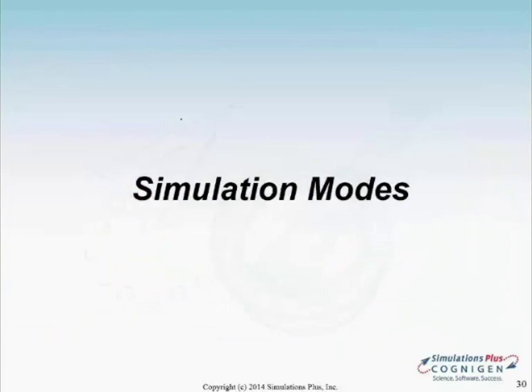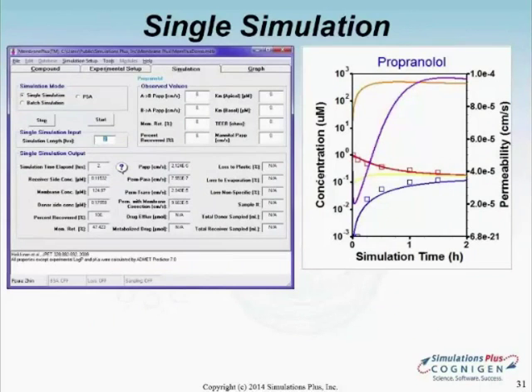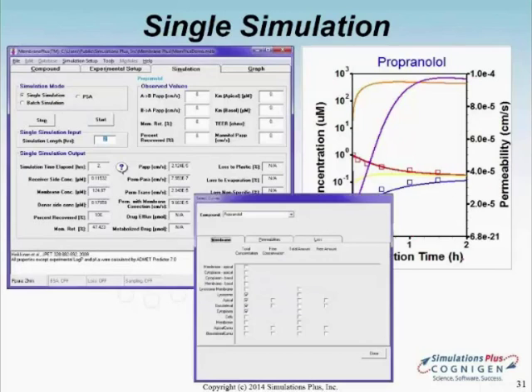Run simple single simulation, in which case you can look at the details of the drug distribution throughout the experiment, how the concentrations or the drug distribution in different compartments is changing with time. And you have a variety of outputs to plot from. You can look at the concentrations, amounts, free amounts or unbound amounts in your compartments in the basolateral and apical media. Again, something that may be important to look at, especially if you added albumin into the media.